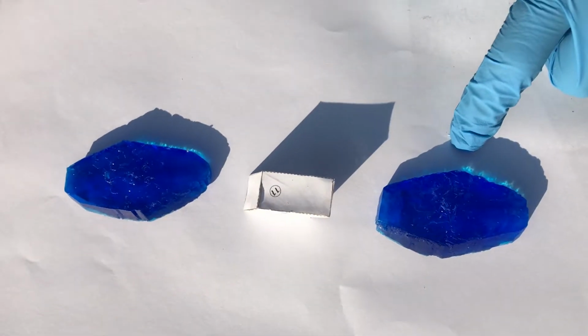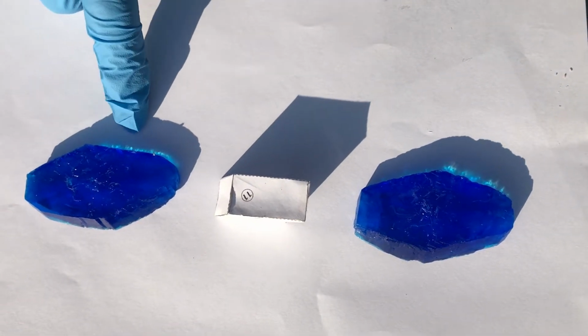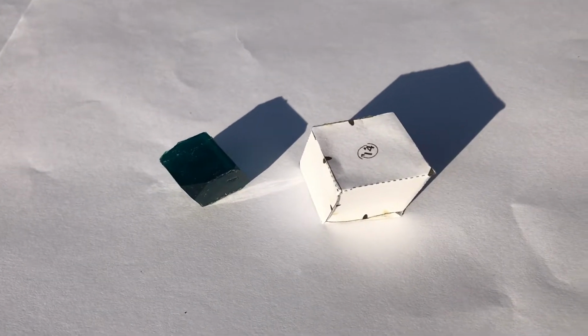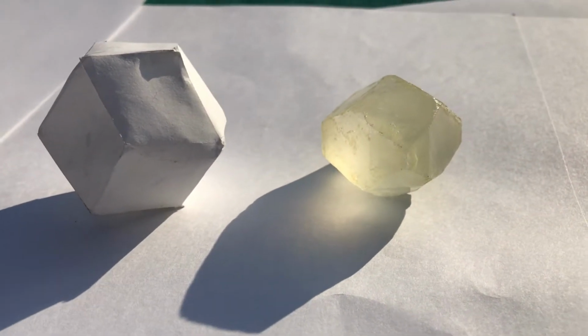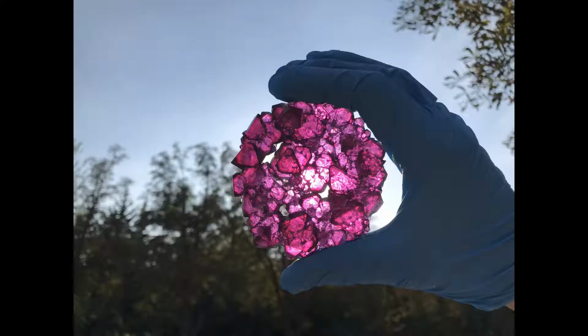Growing crystals requires a lot of time and patience. If you want to get a very smooth and beautiful single crystal, you'll need to filter the solution every 2 weeks to maintain its cleanliness. If the solution is dirty, a crooked crystal will grow and you'll get a polycrystal instead of the single crystal we want. A polycrystal is when a lot of crystals fuse together.